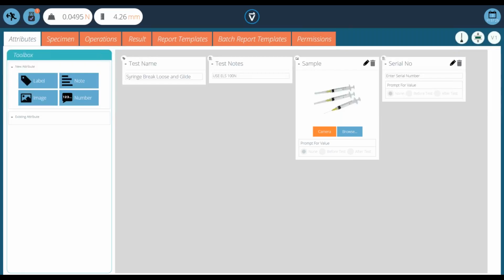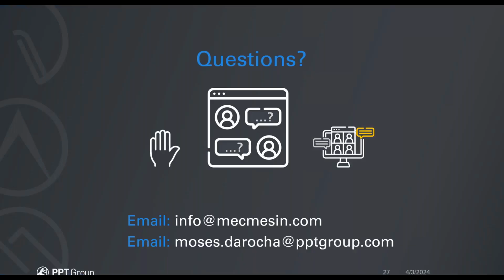Thanks, Moses. There's, I think, time for one more. And the next question is, does it make a difference what material is used in the needle sharpness test? Excellent question. Not necessarily. The key here, and most physical testing is just looking to simulate what happens in real life. But my advice is always pick a material and stick with it.